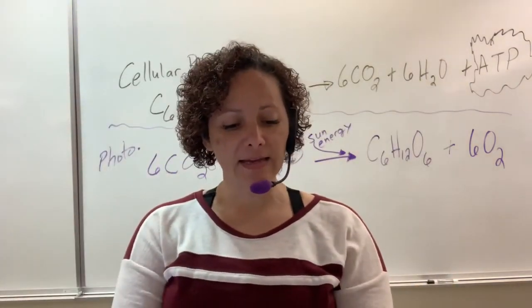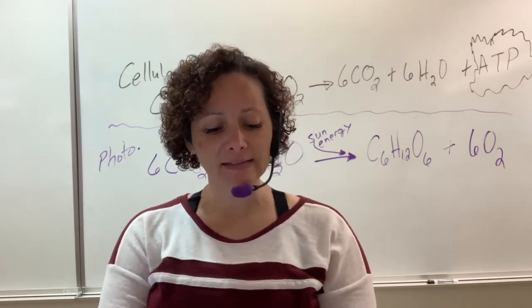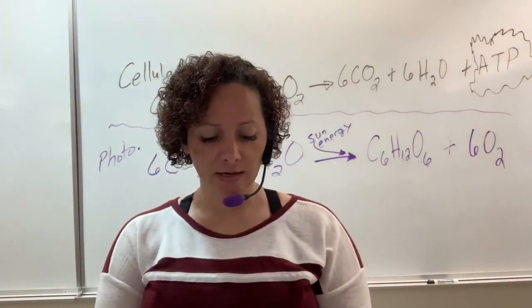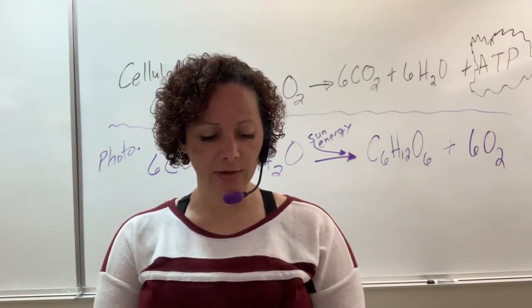So right away, it tells you where to choose. We're looking at the CO2 gas. It doesn't matter if you're in channel 1, 2, or 3. It'll just choose a channel, okay? Whatever channel you're in, hit OK. And then we're going to go ahead and calibrate.